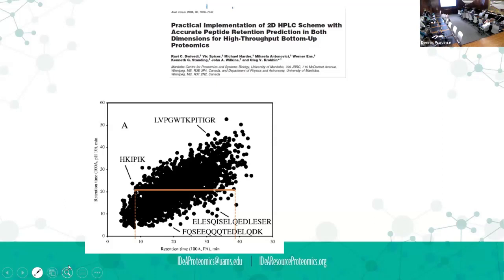Reverse phase is a great way to fractionate peptides because you get good chromatography. You get nice narrow peaks. It's reproducible, temperature controlled, and recovery is really high. The sample always binds when you put it on the head of the column, unlike HILIC, which seemed to bind on every other Tuesday or something.